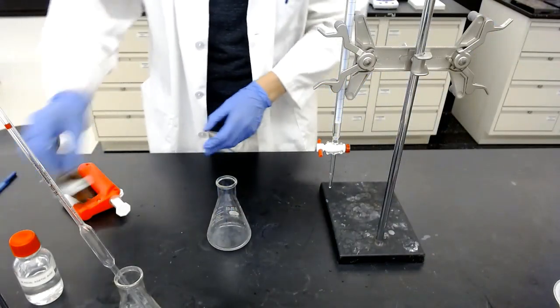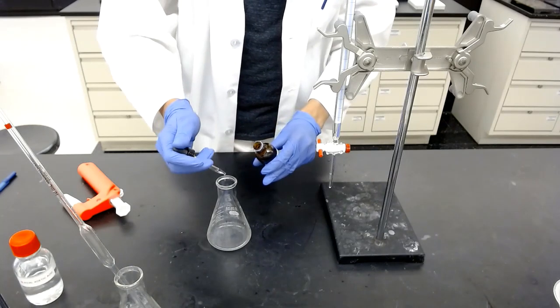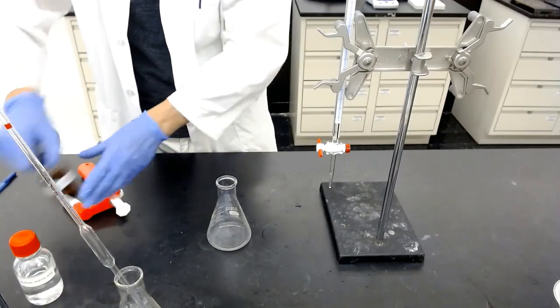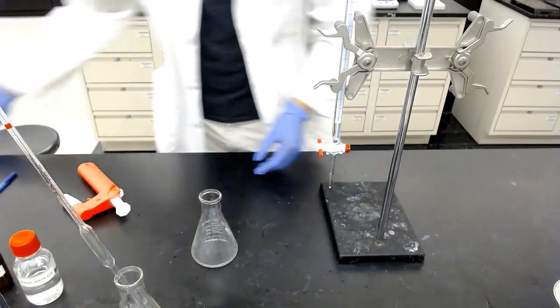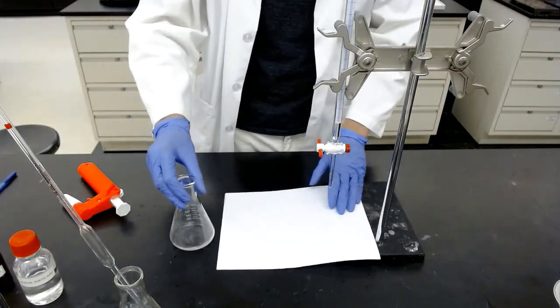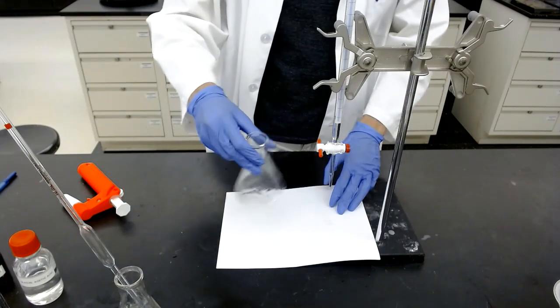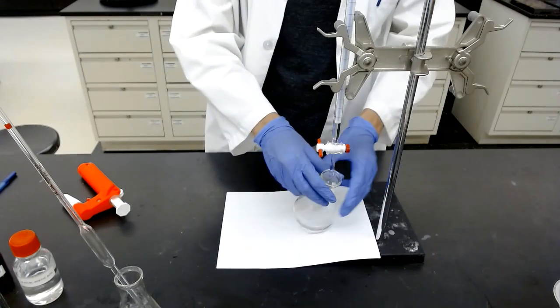Of course, before the titration, always add a couple drops of phenolphthalein, which is the indicator solution, and mix it up. Bring white paper for contrast, and I have refilled the burette already up to 0. We are ready to go for the third titration.